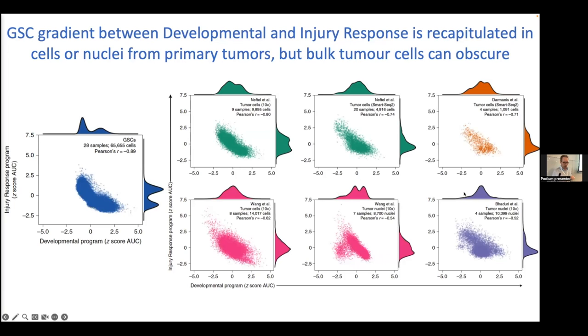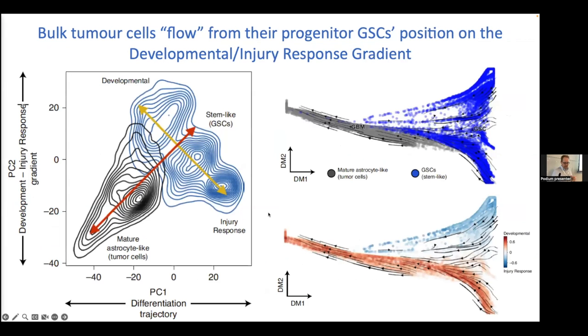Some of these tumors are more pure than others, so you can definitely see the signals in there, but it's not something you would necessarily have seen using bulk sequencing, or even unselected cell sequencing. This biology is not necessarily apparent. And this is the final model. Gary actually named this the peanut wizard hat, because we used to have it oriented this way, with the black bar going up.